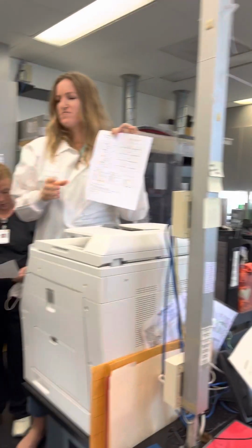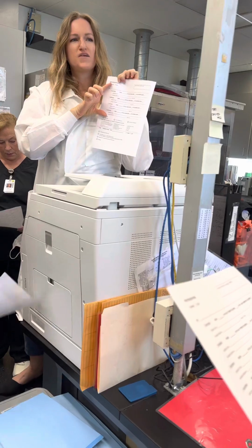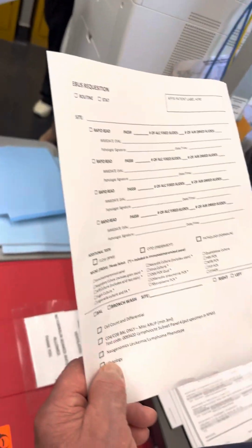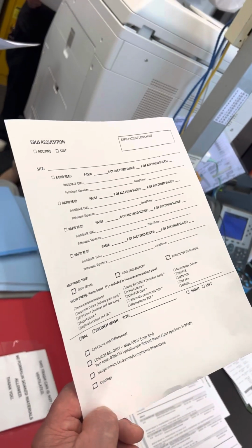You guys are trying to accomplish with these specimens. The first one is getting your rapid read information, and the second thing is getting the correct tests ordered for that specimen. And so this paper will handle both of them.